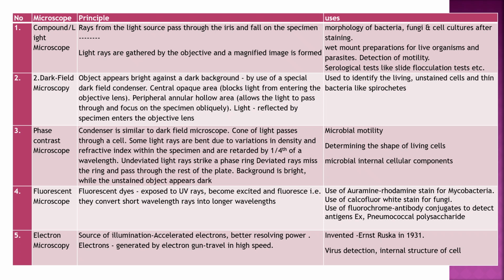Principle: rays from the light source pass through the iris and fall on the specimen. Light rays are gathered by the objective and a magnified image is formed. Uses: morphology of bacteria, fungi, cell culture after staining, wet mount preparation for living organisms, motility, serological tests.